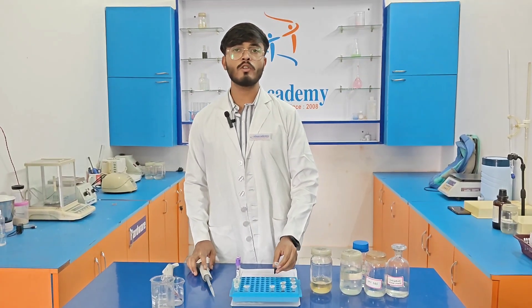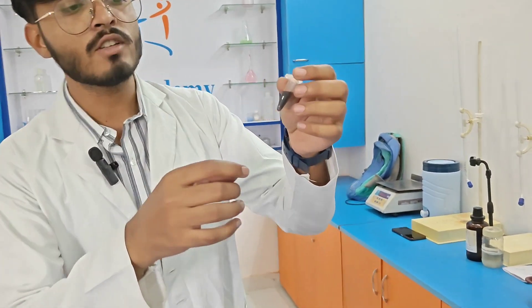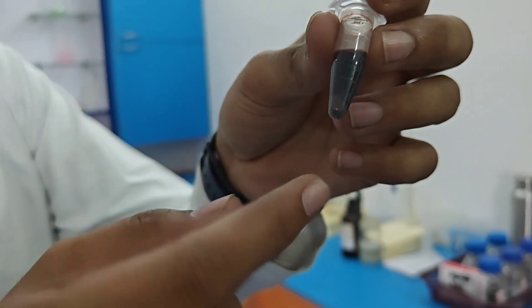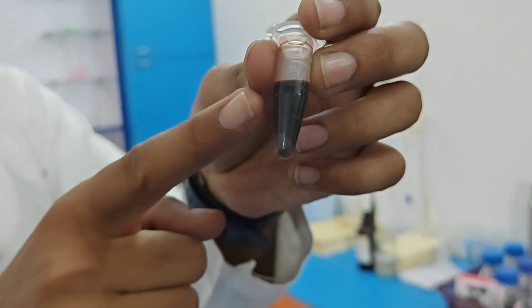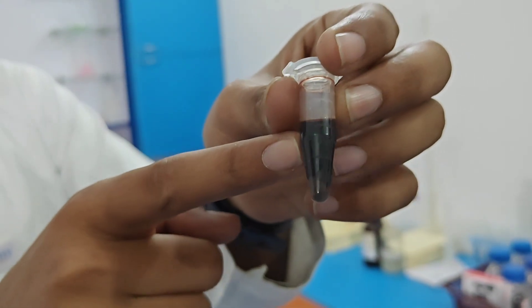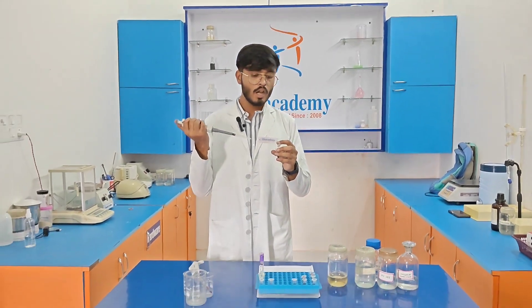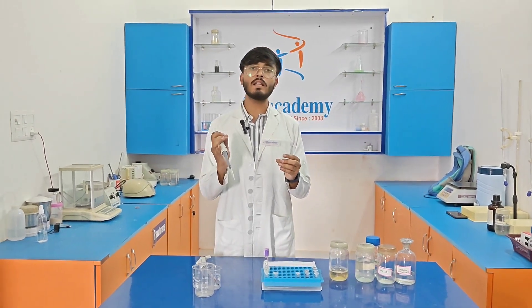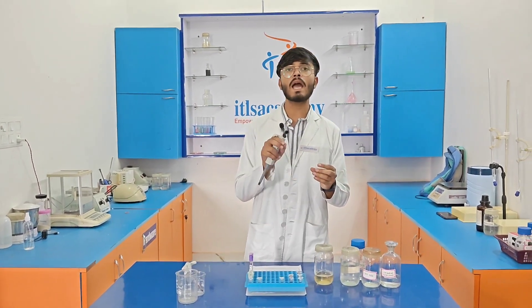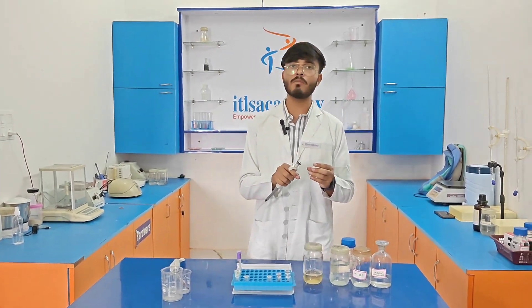After centrifugation, we are going to discard the supernatant. As you can see, two layers are visible — a light color layer and a dark color layer. We need to discard the dark color layer. After discarding the supernatant, we add 400 µl of lysis buffer to each eppendorf tube and repeat the process until we get a white pellet, keeping centrifugation at 11,500 rpm for 5 minutes.